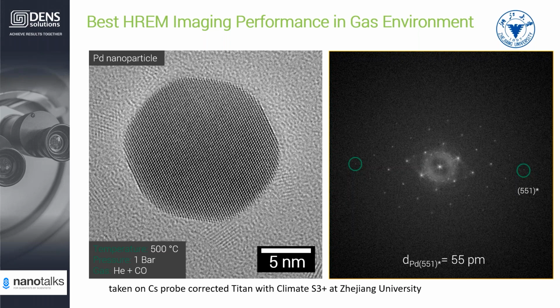So from my experience, you need to prepare your starting solvent dilute, not as dilute as possible, but after the ultrasonic, I will let it stand still for a moment, and then only use the solvent on the top part, which means the particles are quite dispersed there.